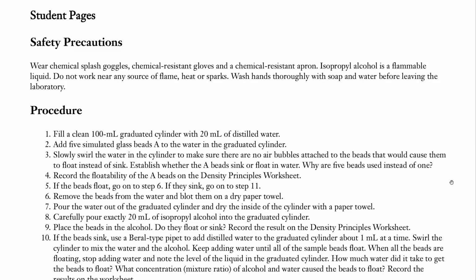You're going to want to wear chemical splash goggles, chemical-resistant gloves, and a chemical-resistant apron. We're just going to wear the gloves. Isopropyl alcohol is flammable. Don't work anywhere near any sources of flame. And wash your hands with soap and water, because not only this lab, but COVID.